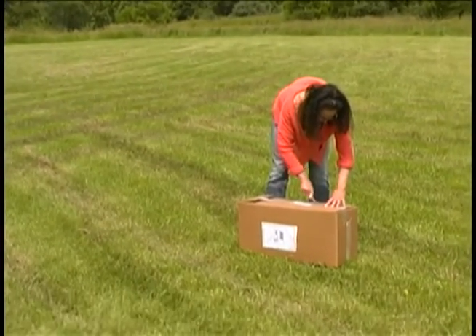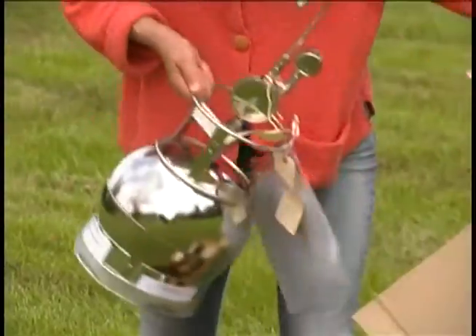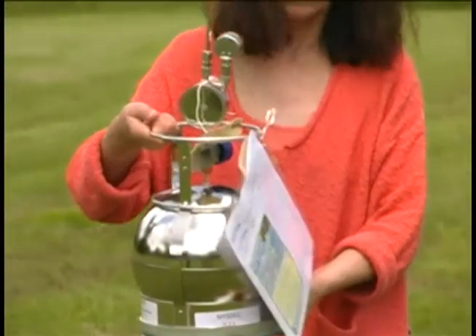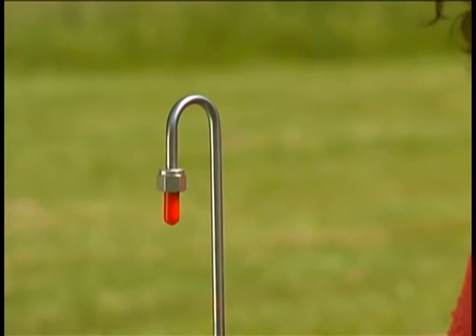Carefully open the box because it's going to be used to ship the canister back to DEC and we want to maintain its integrity. Holding on to the rim of the canister, carefully remove the sampling canister taking care not to bump the sampling cane. Never lift the canister by the sampling cane.